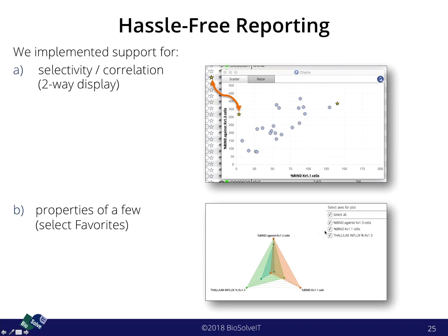Both these graphics facilities within PepSee have a little button on the top right side here, which makes the graphic go into the clipboard, so that you can just with a quick Control-V paste them into PowerPoint or Word or wherever you like.